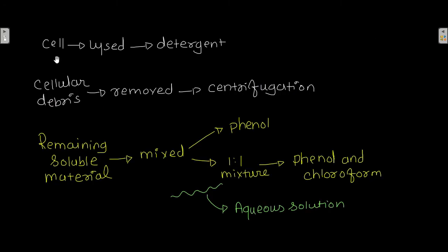Now, the cells are lysed with the help of a detergent. The detergent is used to break down the cell, and then cellular debris is removed by centrifugation.